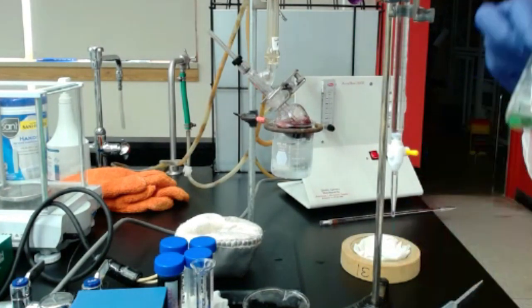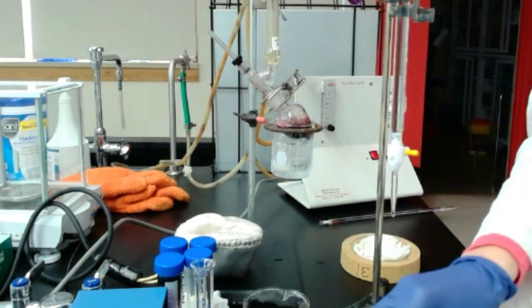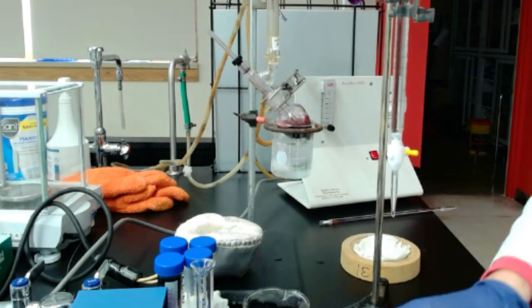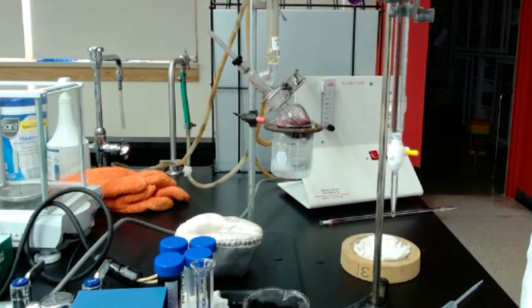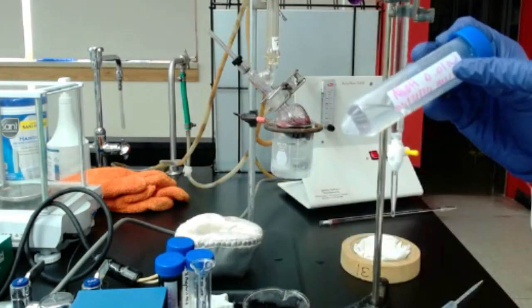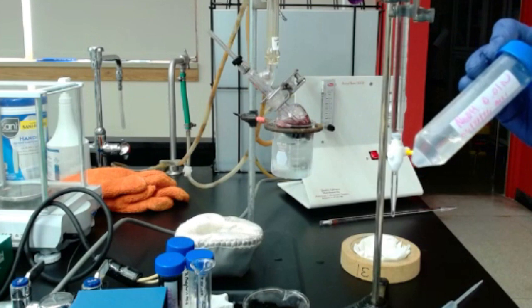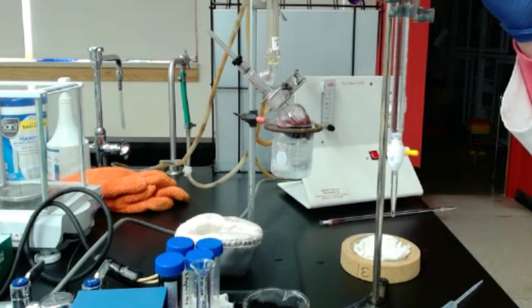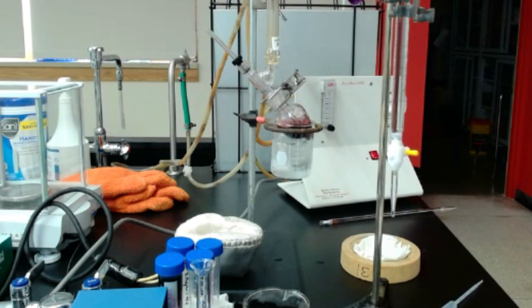To know how much total SO2 I have in that sample, I will do the subtraction of 18.1, which was my final volume, minus my initial volume, which was 17.7. And this value will be multiplied by a factor of 16. This factor of 16 is only when you use sodium hydroxide of 0.01 normal. If you use another strength, you're going to have to multiply by the strength of sodium hydroxide. But here, it's only the final volume minus the initial volume times 16. And that's going to provide me a total SO2 of 6.8 ppm. You can see that's not very much.